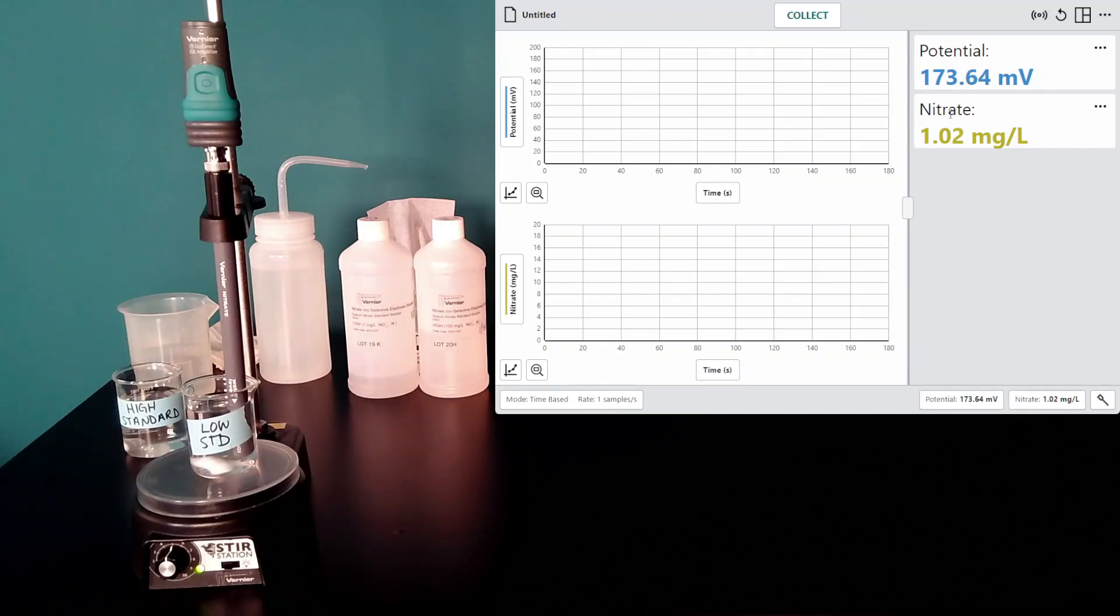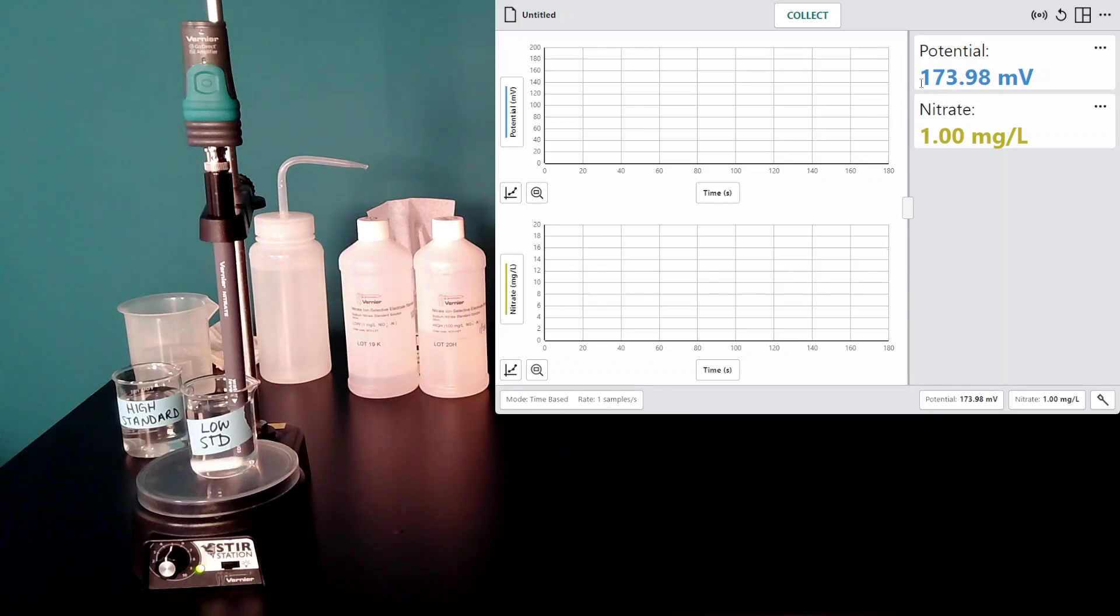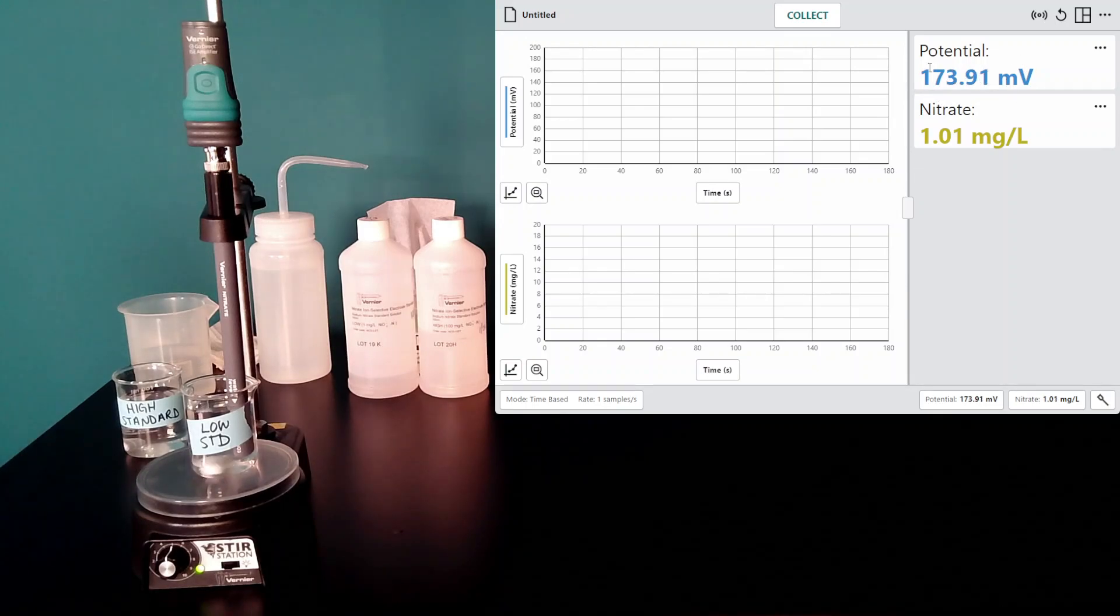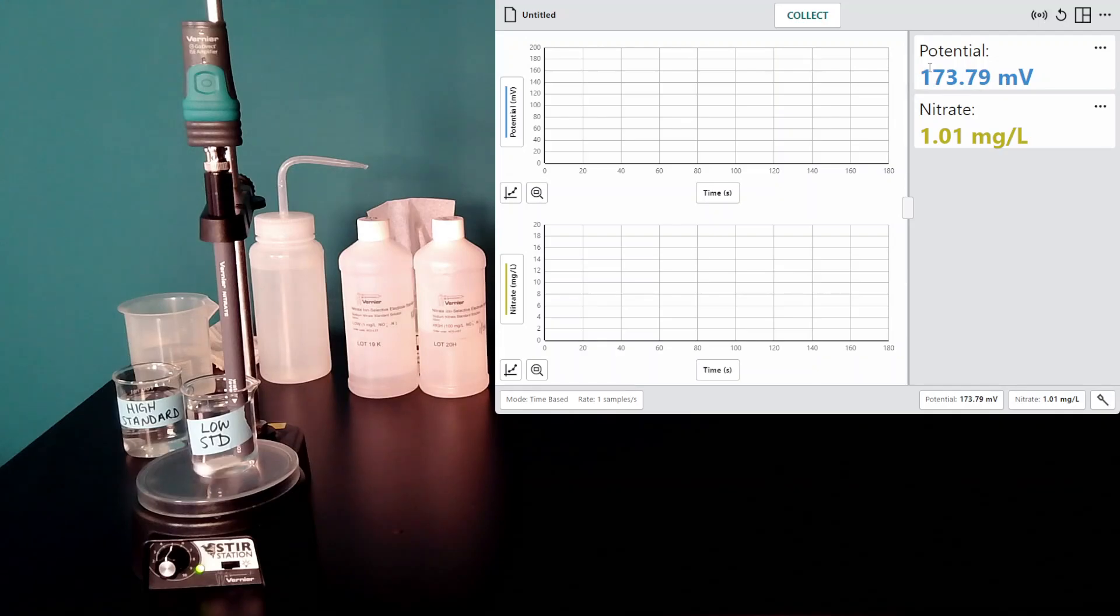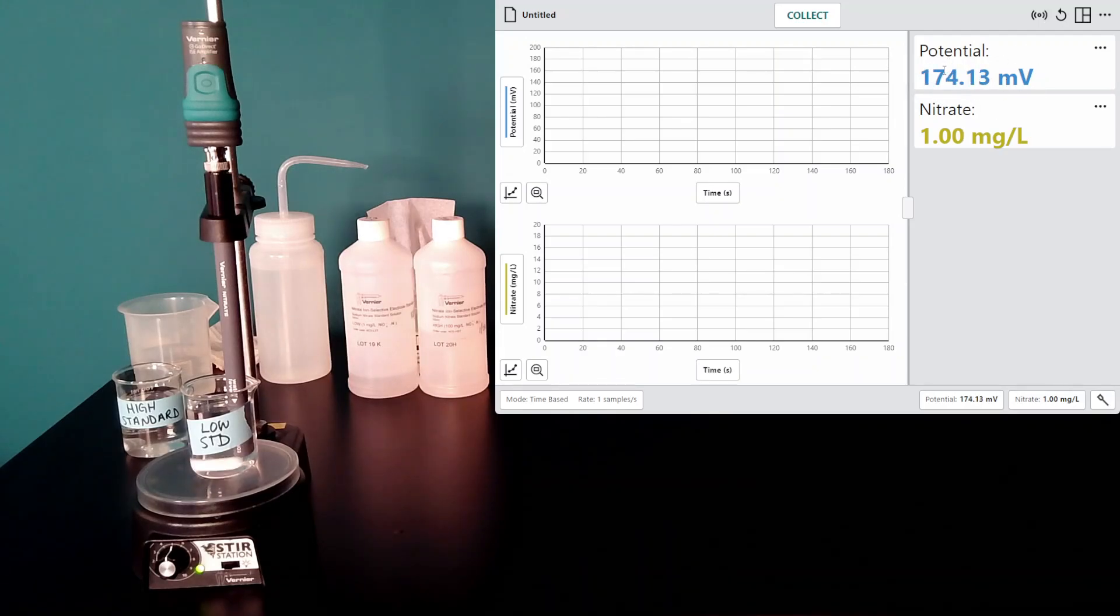Now my sensor reads 1 milligram in the low standard, and the potential reading here should be about 166 millivolts. So that is within the range I would expect.